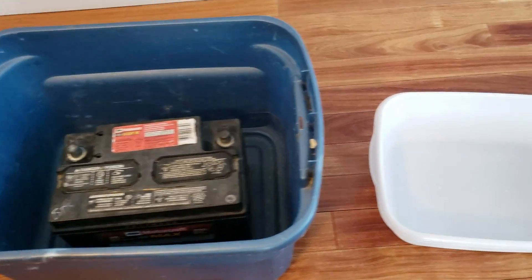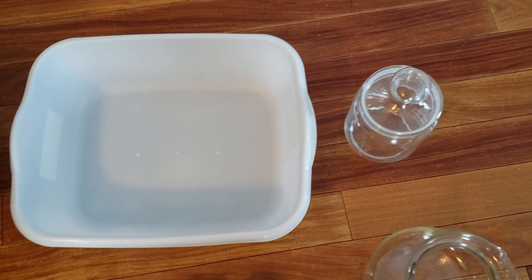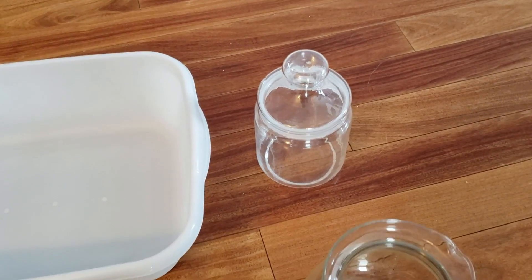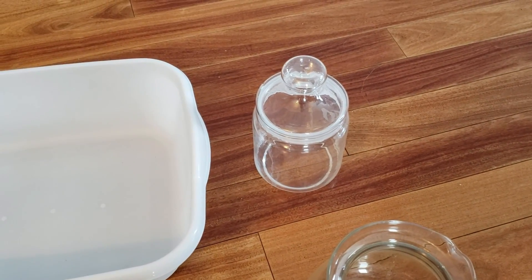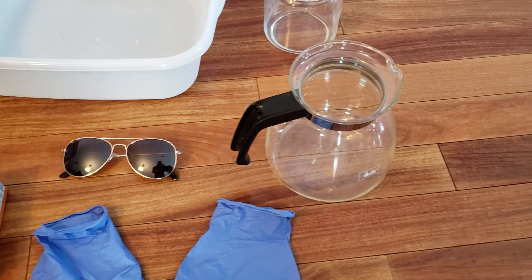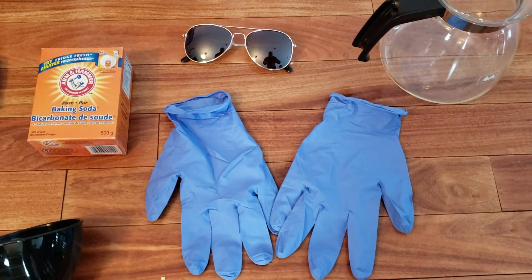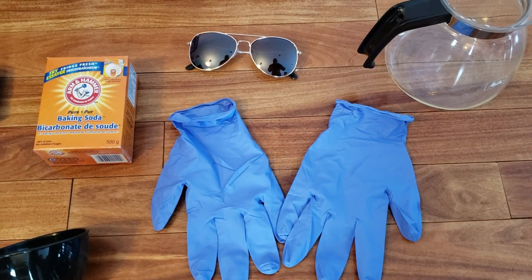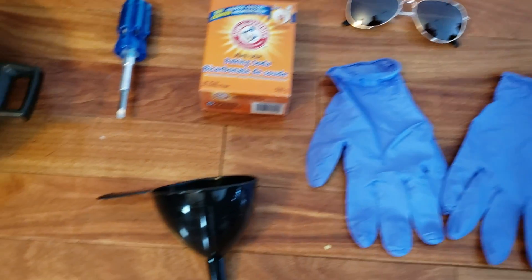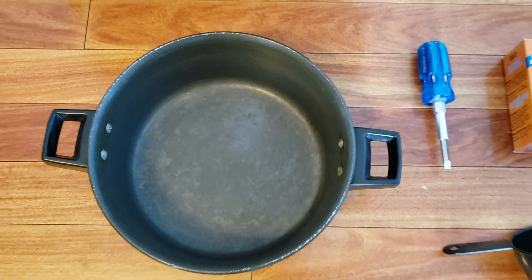First, you will need a car battery, a container for the car battery, a bucket, a glass container for the sulfuric acid, a container for boiling the car battery acid, safety gear, baking soda, a funnel, a screwdriver — and the pot is basically useless.